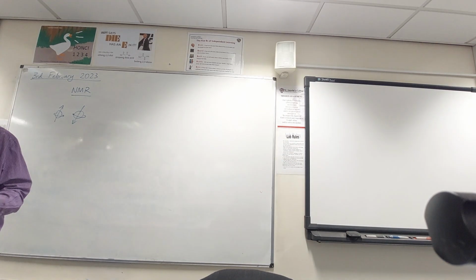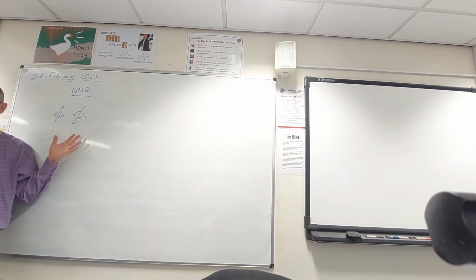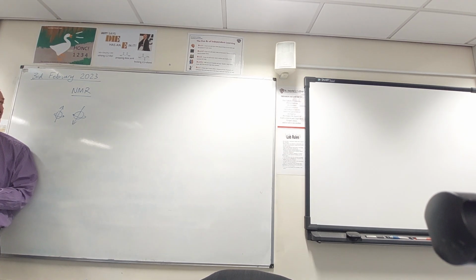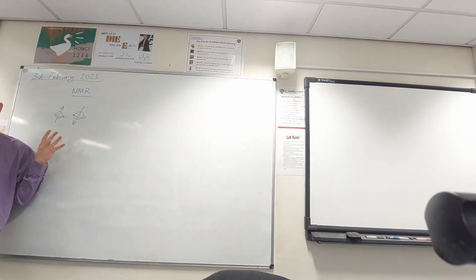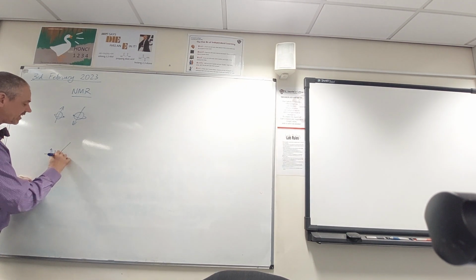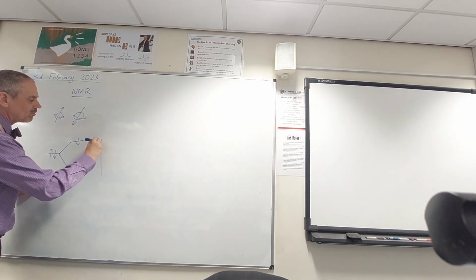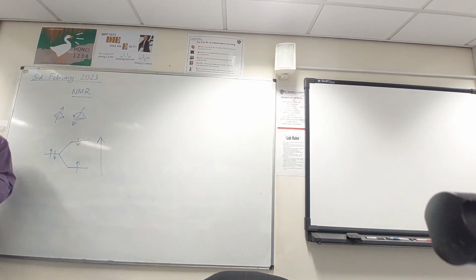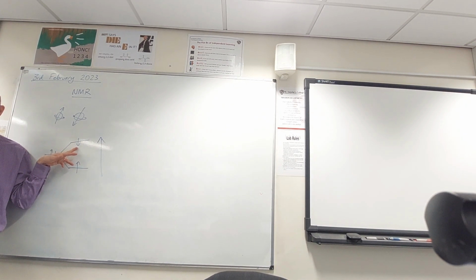Again, you don't really need to know that, but it explains why I'm going to be drawing arrows on the board when I'm talking about the states of different nuclei. What we can do then is impose a magnetic field on our sample, and the up and down states will tend to split in terms of energy, with some of the nuclei lining up with the magnetic field and some of them opposing it.